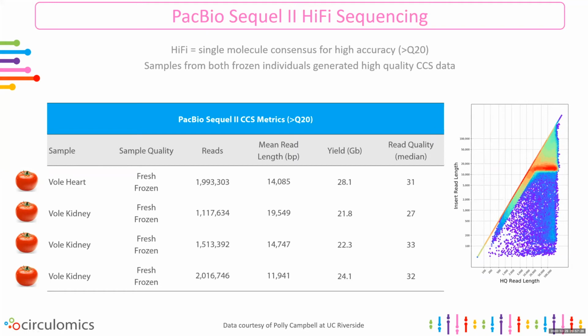So here, we've seen how different input tissue qualities and different treatment methods, whether it's fresh frozen, different tissue types, whether it's degraded, trap caught, RNAlater preserved, can be dealt with to improve the sequencing results, or to try to get the best that you can do with the conditions you have. So for the second half of the talk, I'm going to switch gears a little bit and go from these samples, which vary from good to slightly compromised, to what you can do when you have a really high quality sample.